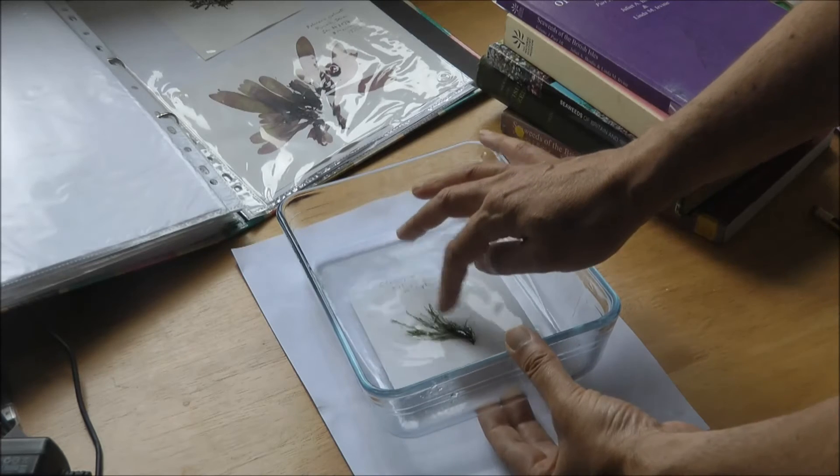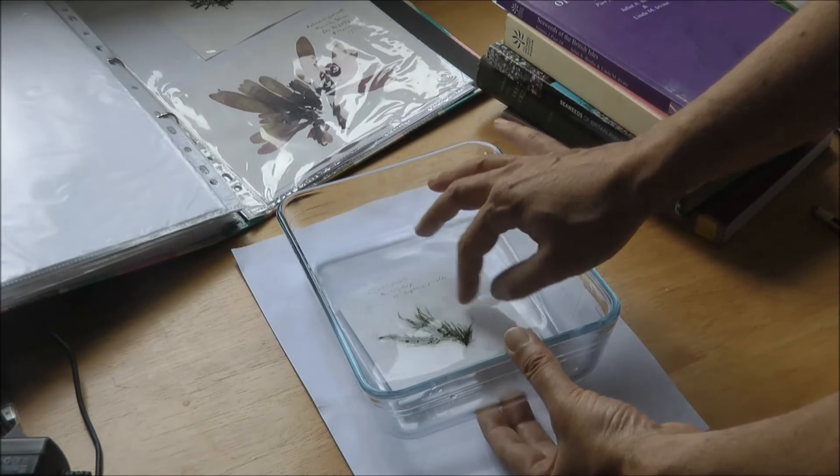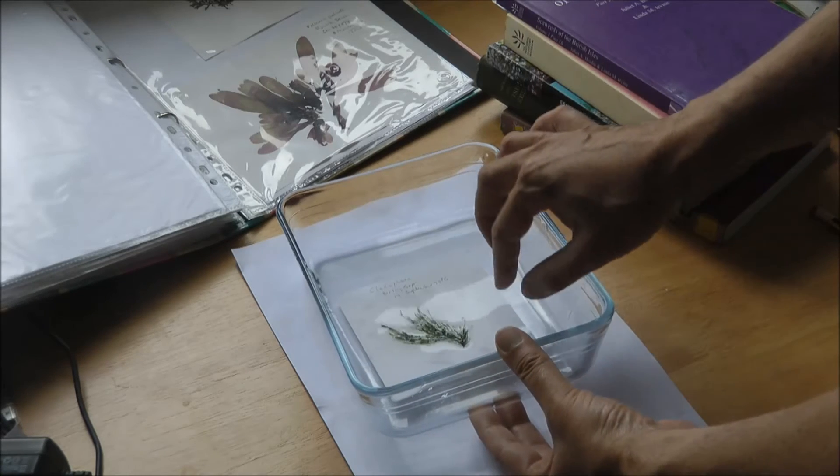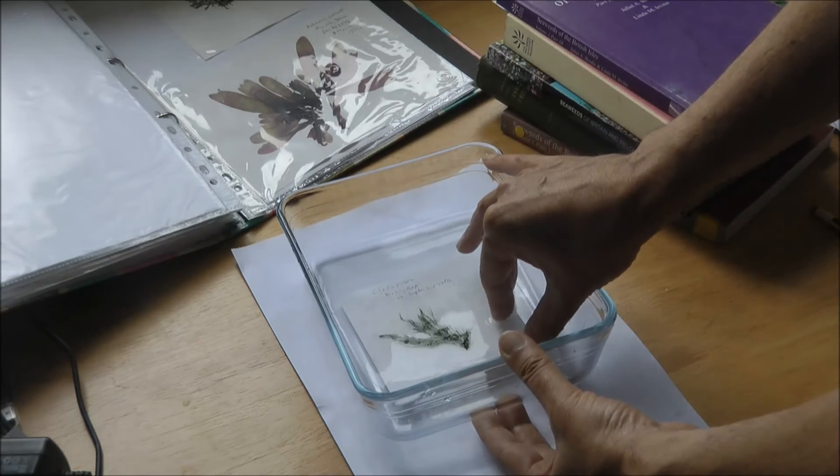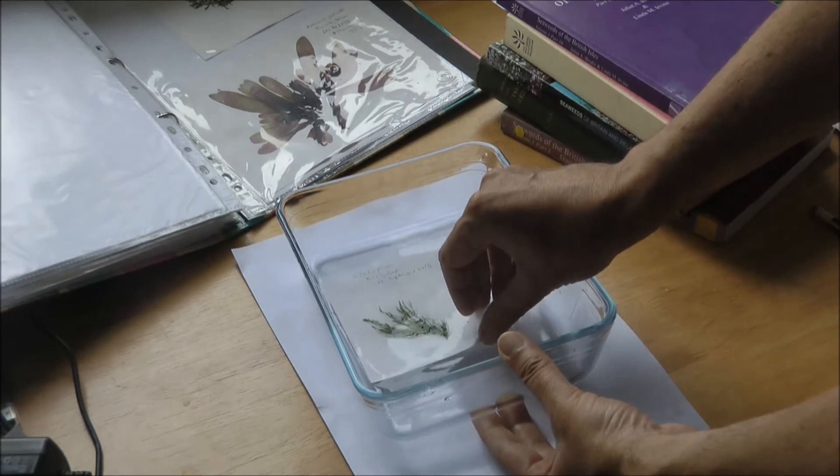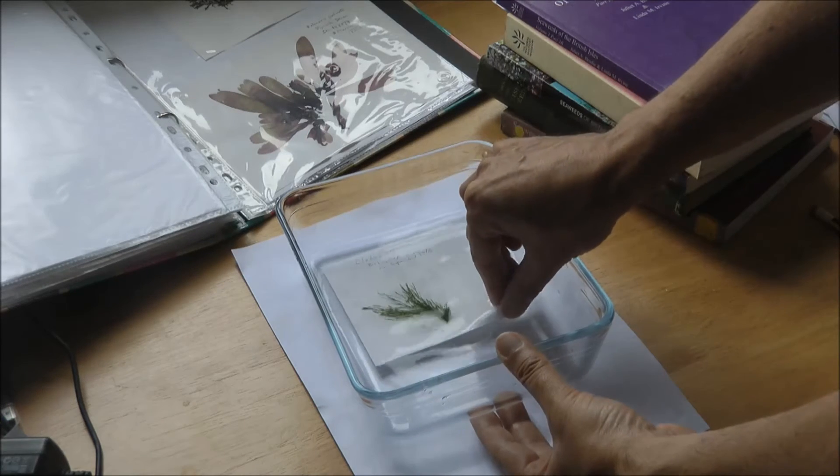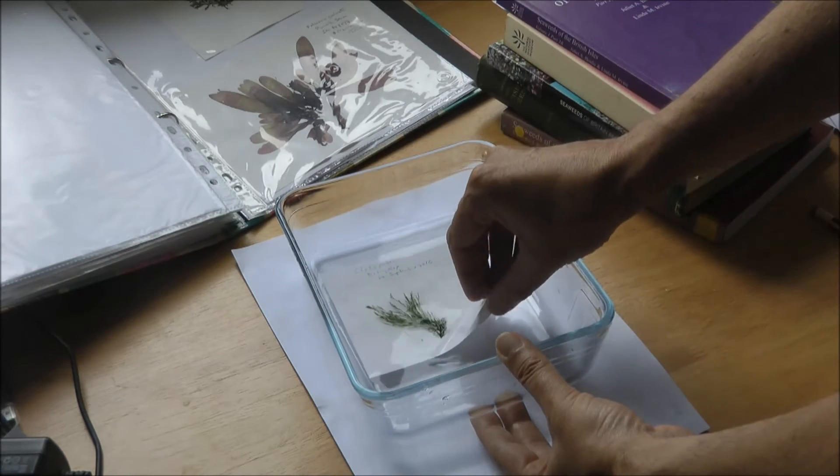And gently with fingers or tweezers if you've got them, try and lay out the seaweed so that it best displays its main features. You can see the shape of the fronds and everything like that. You may need to chop some bits off if it's a particularly big and chunky specimen just to get it to display better.